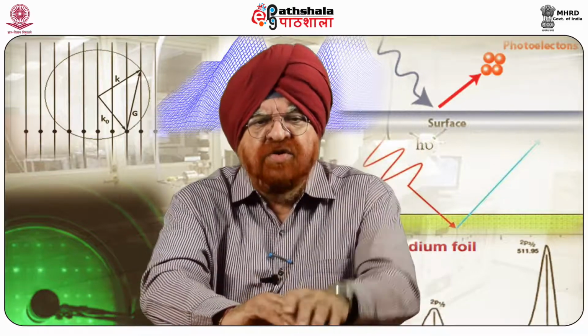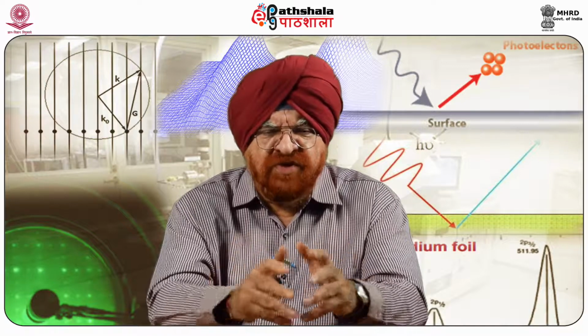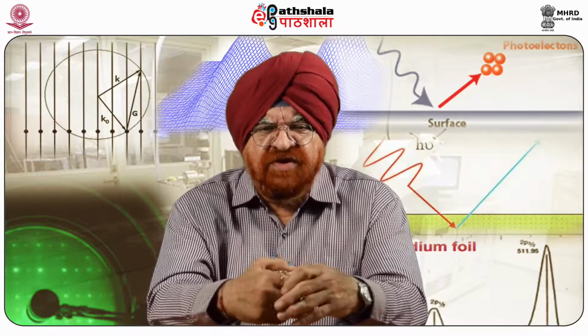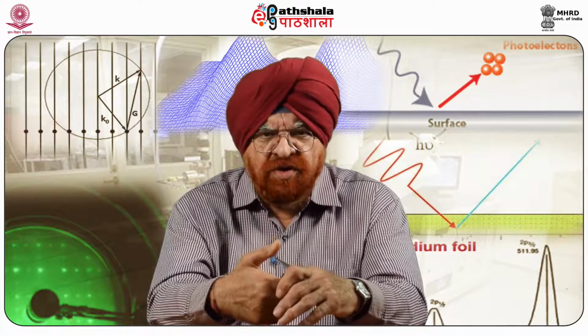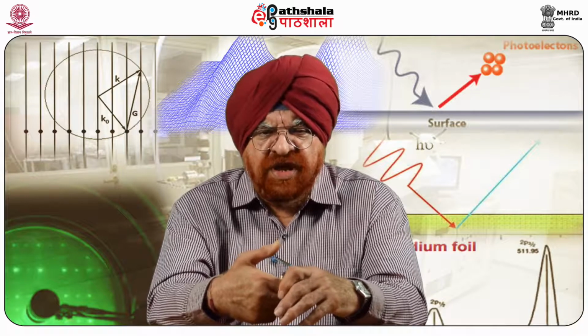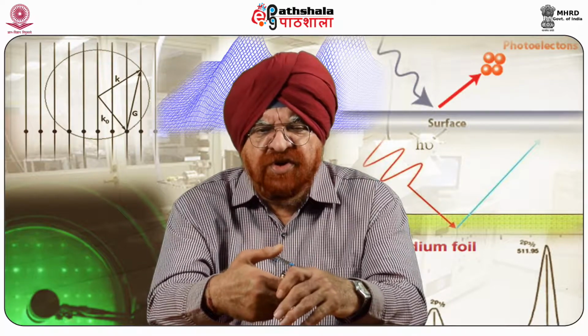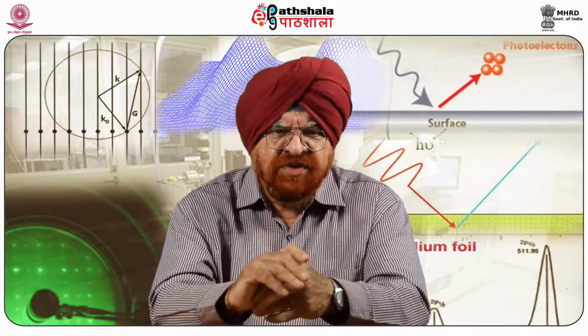So, students, after having studied magnetic force microscopy and the way images are formed, we have dealt with data analysis in this particular module. You have seen the importance of this, as well as the preparation of surface data, which has been studied with the help of this.